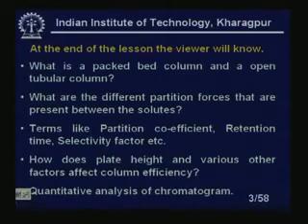It depends on the material of the column, and the efficiency will also distinguish between the two components very nicely, otherwise it is very difficult to find the percentage contents of the individual components in the mixture. Then quantitative analysis of the chromatogram: how we can make a quantitative analysis of the plot we get from this chromatography, which we call a chromatogram.